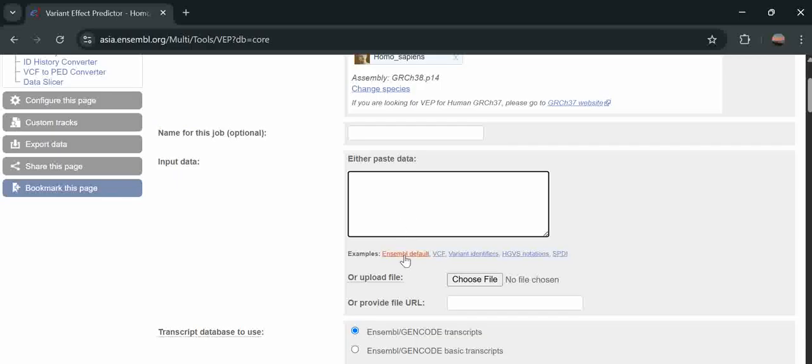We could also do it with the chromosome number, genomic coordinates, and nucleotide substitutions: chromosome, position, replacements. Today we're going to use the variant identifiers, which we call RSIDs. You can also use the transcript number and the change in the nucleotide.